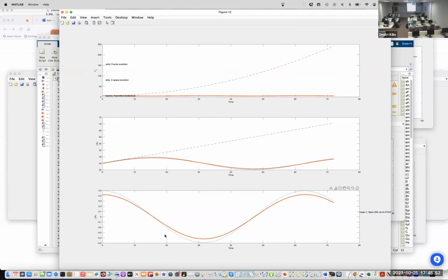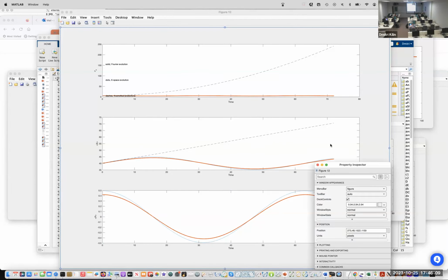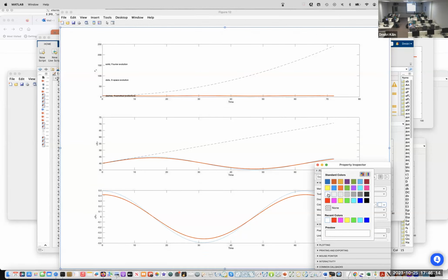For final results, it's always better to redo them manually, at least to remove the gray background that you may have figured out how to do, or may figure out in the future. I believe one clicks on the arrow, double clicks there, and selects color white.